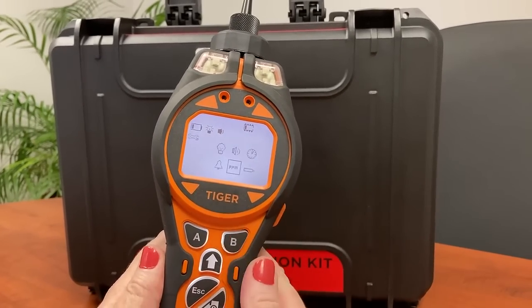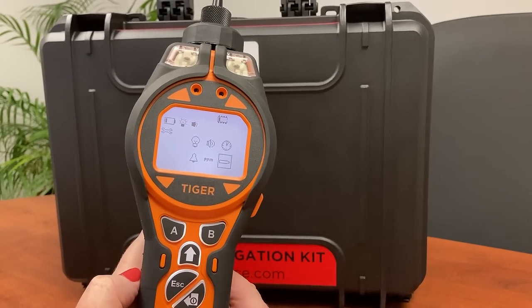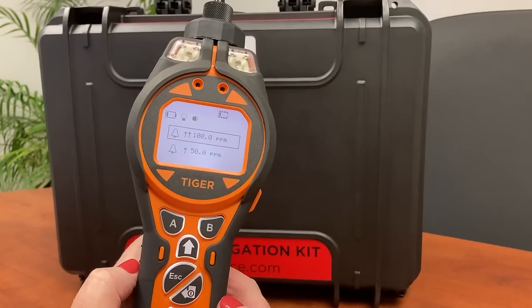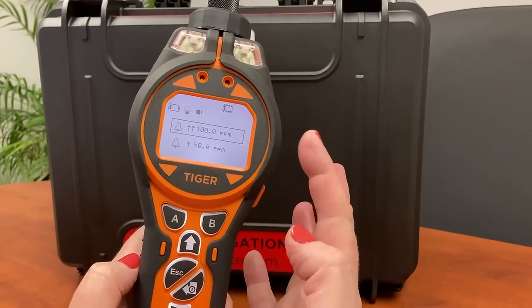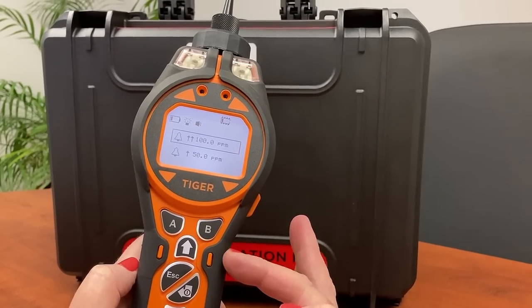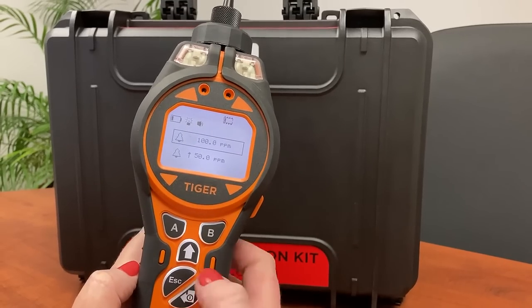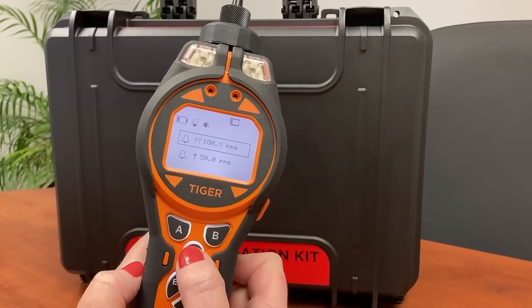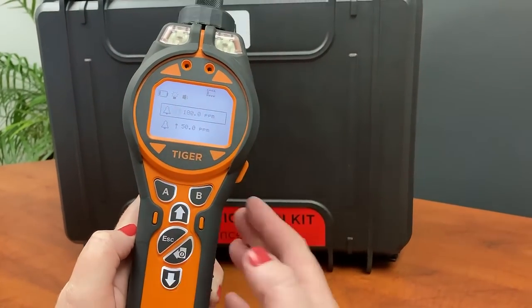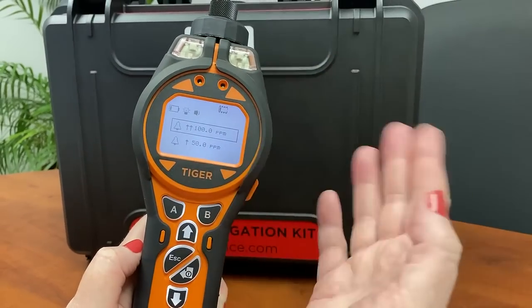The settings button on the right gives us sound, light, and time settings, and also our alarm settings. This is quite important because in isobutylene the preset high and low alarm levels are set, but for other gases there are no high and low alarm levels set. You would then customize this here — you enter and use the up arrow to change your upper or lower limit. If you don't set limits, it's not going to alarm and it won't give you audible or visual alarm.